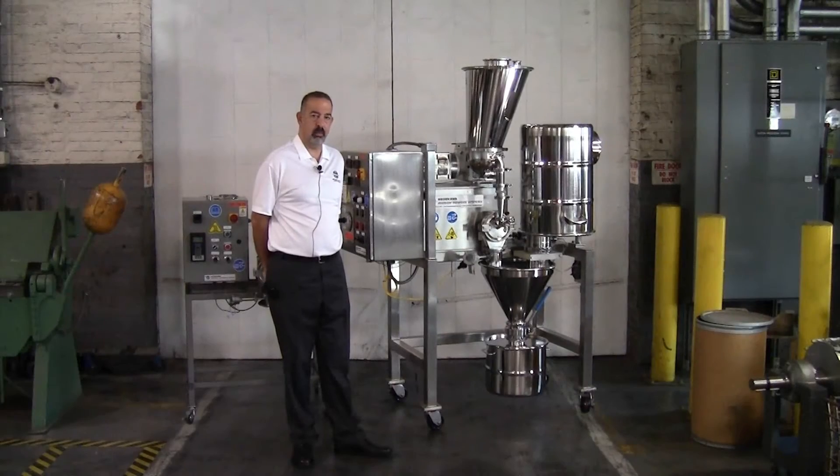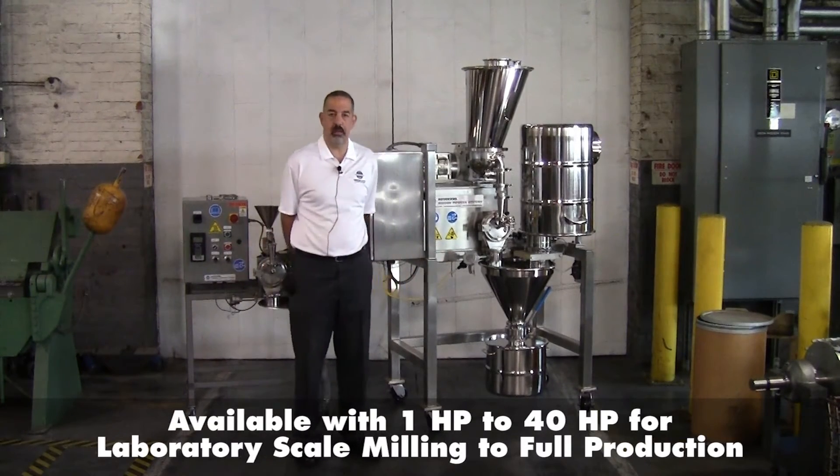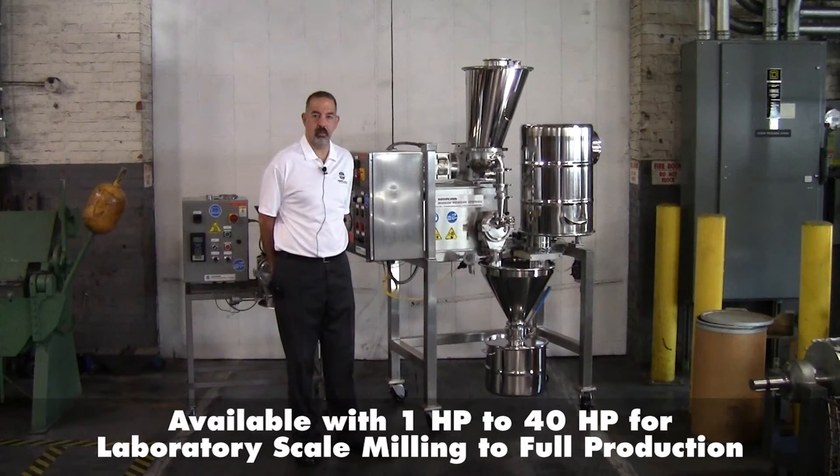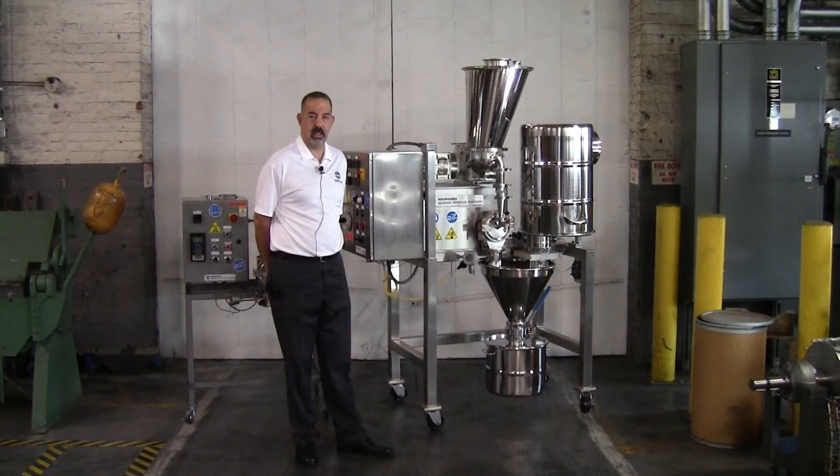The UMP model range comes in multiple sizes. The one we're seeing here on both sides of me is the UMP-B Bantam model with a one to two-horsepower motor. We also make a smaller unit with about a two-inch diameter rotor, and units that are UMP-1, UMP-2, and UMP-3 lines going up to production sizes.